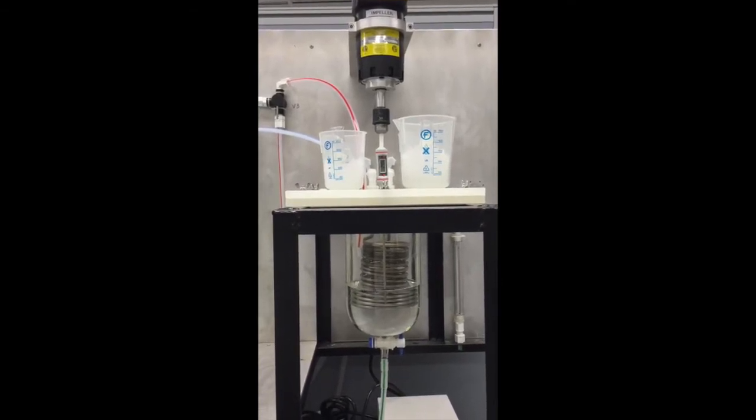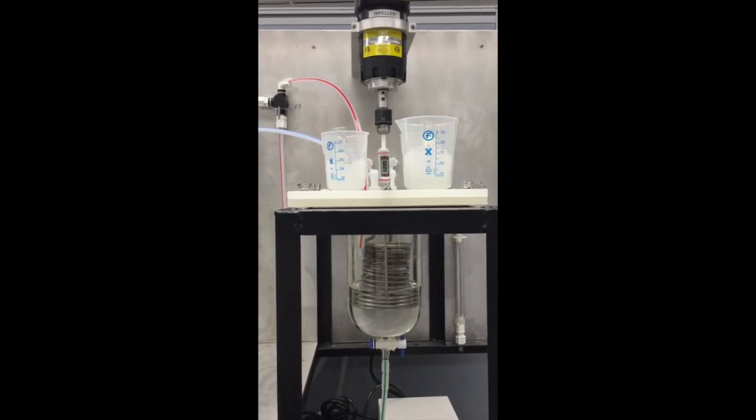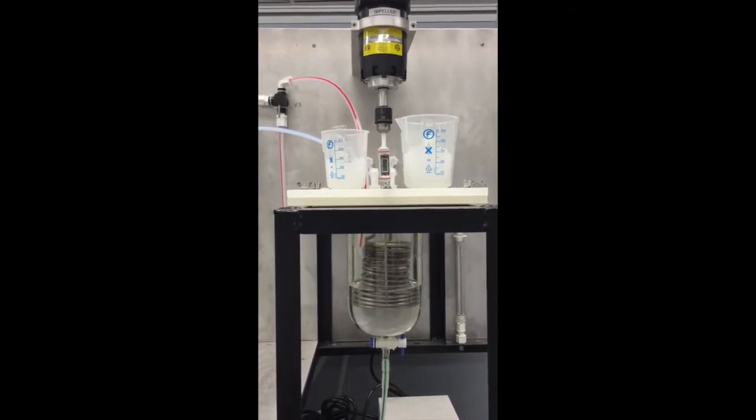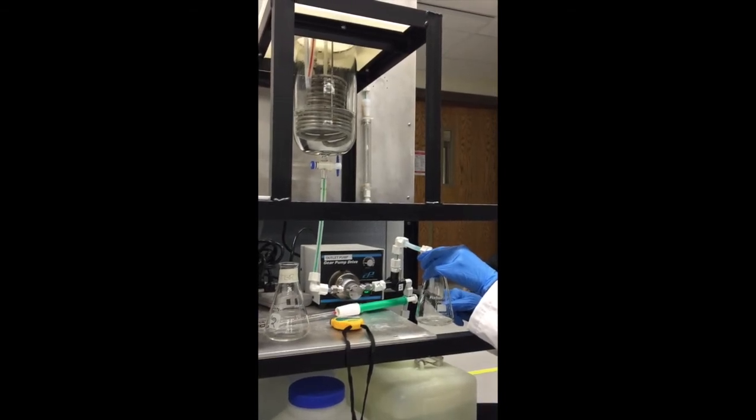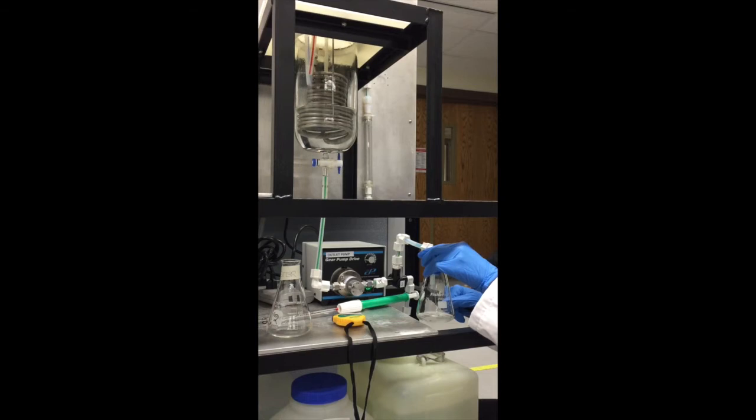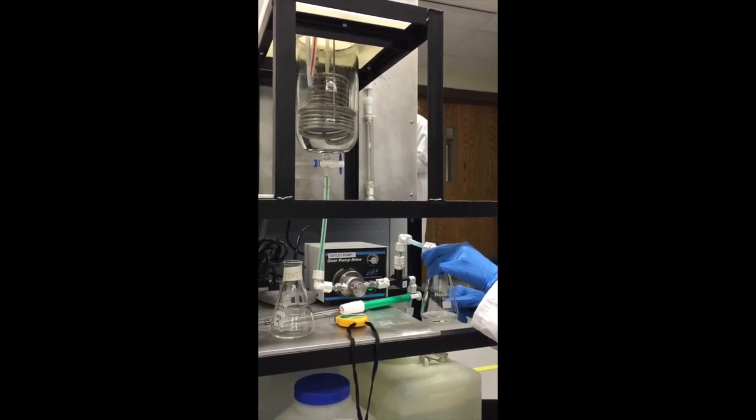Place 5 milliliters of hydrochloric acid in 3 separate Erlenmeyer flasks. Next, set the temperature of the heater to the appropriate temperature. Place the reagents and set the timer for 10 minutes. Then pour the contents of the Erlenmeyer flask, where the reagents were mixed, into a flask containing the hydrochloric acid.